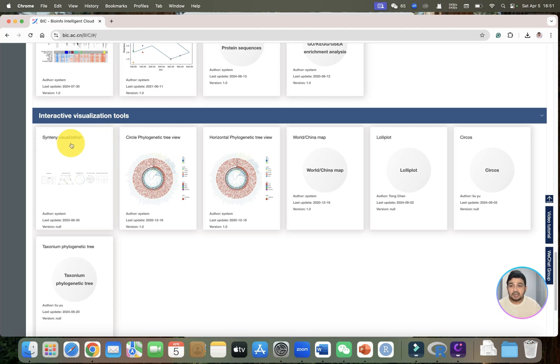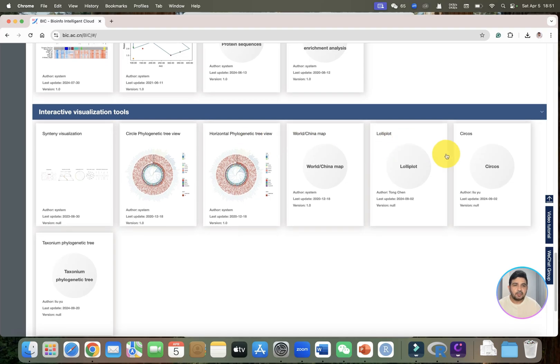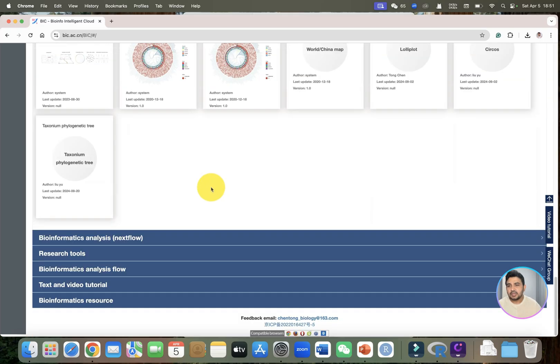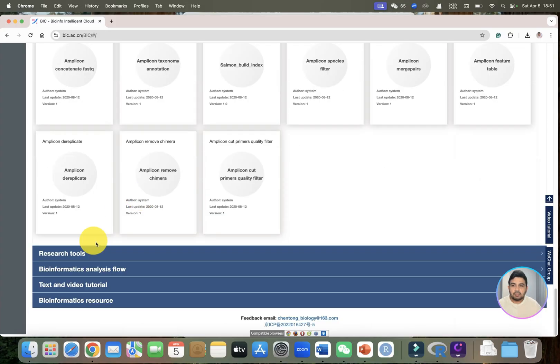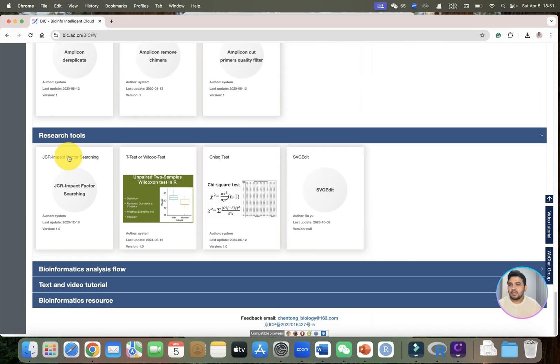We also have interactive visualizing tools like synteny analysis, circle phylogenetic tree, horizontal phylogenetic tree, lolliplot, Circos, and bioinformatic analysis as well. There is much more to explore.